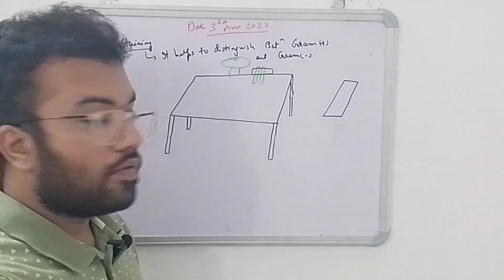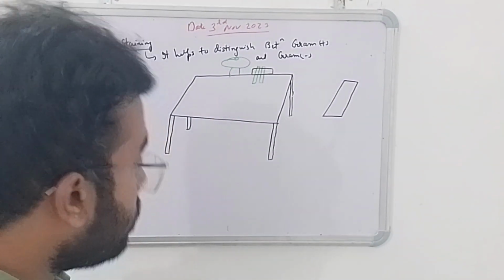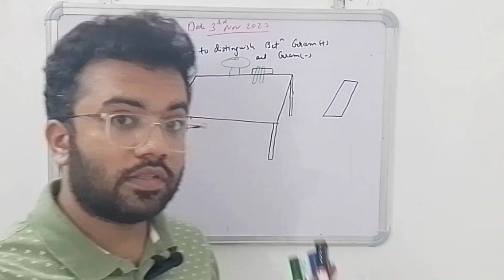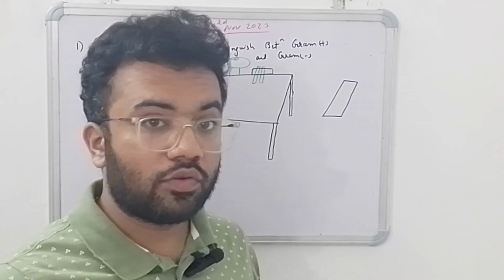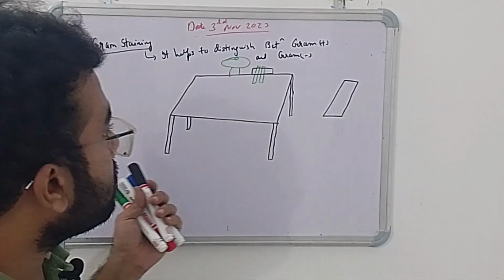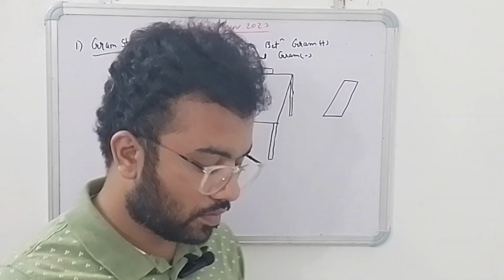Understand what I am saying? You have to take a slide and put it perpendicular to the rack. Now this slide contains a smear. You have to examine this smear under microscopy, and to do that, you have to perform some chemical reactions. Now you have to add some solutions for it.